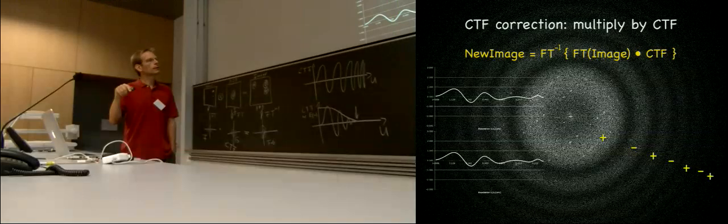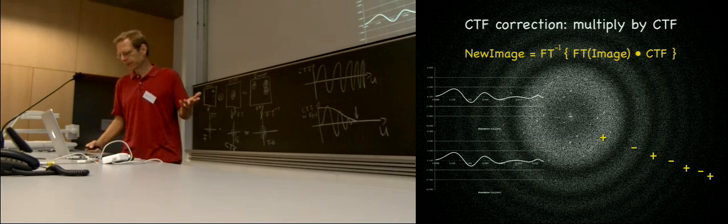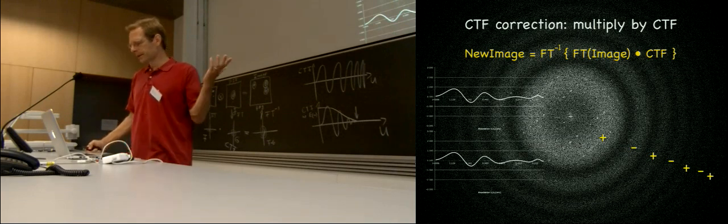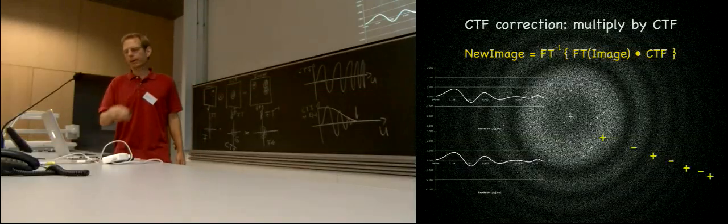That works. We get this contrast right. So here the contrast is inverted, but we make this oscillation even worse. What was already dampened in amplitude is now dampened even further. It improves the signal-to-noise ratio of your final reconstruction, but it's not close to truth.